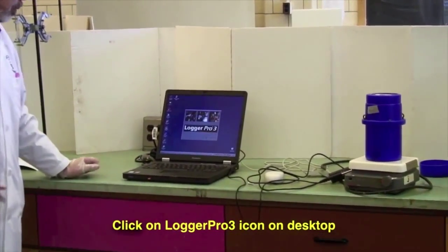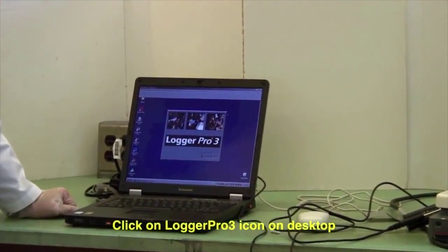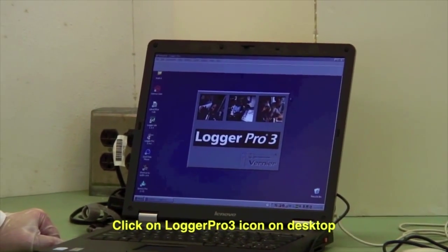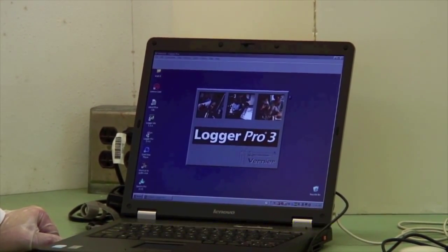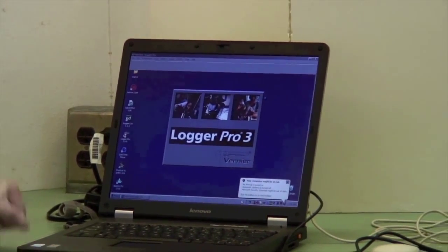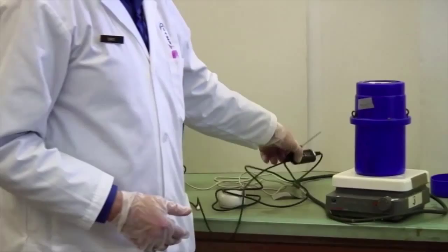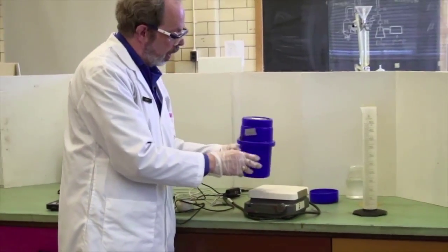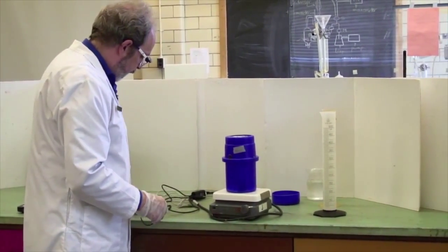So double click on that. It will fire up. And the software is smart enough to realize that you have plugged in a thermocouple as opposed to a pH probe. And it will pull up a temperature as a function of time graph ready to go. While we're waiting for that, let's talk about the calorimeter itself.